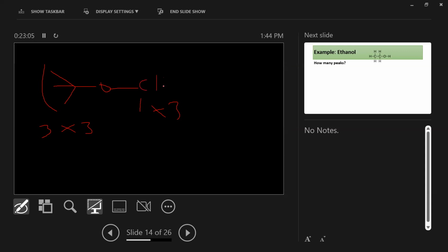This is a CH3. We're talking about integration. You may not always get it as the same ratio as it actually is, so you have to know what type of groups it is. If I know it's a methyl group and I say integration of 1 to 3, I know a methyl group doesn't have 1 proton. We're talking about the number of protons underneath a chemical shift. A methyl group doesn't have 1 proton. That's just insane. If this is 1 and each methyl group has 3, the tert-butyl must have 3 times the methyl group, so it must have 9. You have to know.